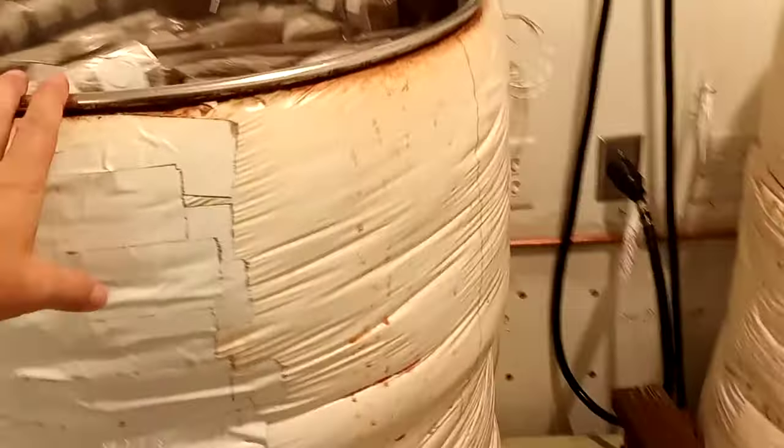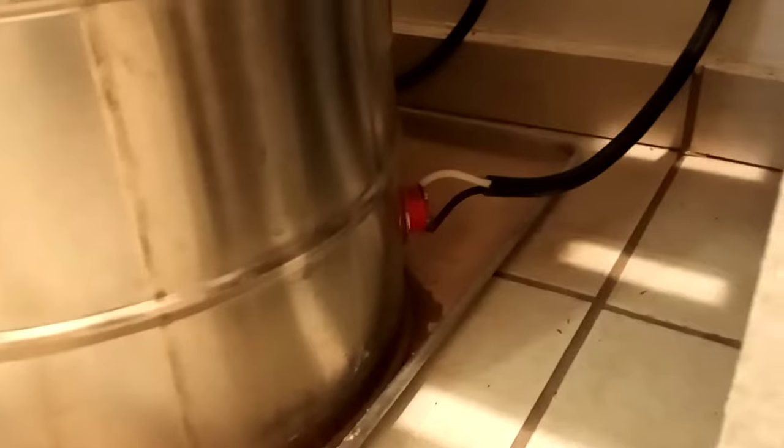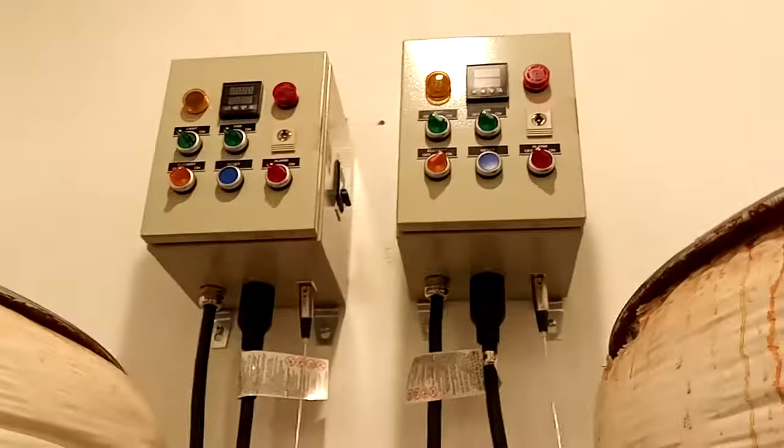They're made out of 55-gallon stainless steel drums that have been wrapped in insulation, and then we've got 15-gallon stainless steel drums on the bottom that are the actual boilers. You can see they've got the 220 element plugged in there, and we've got 220 sockets that were put in here to run all this stuff.